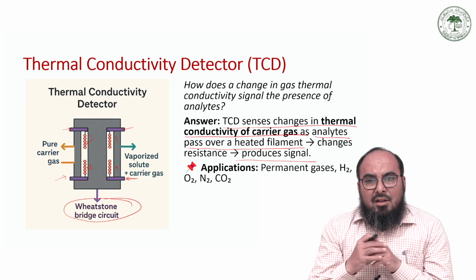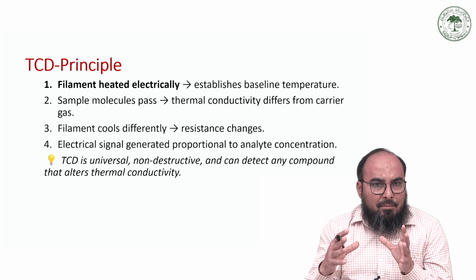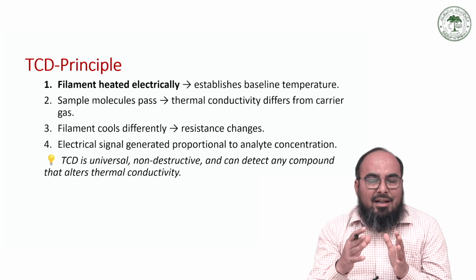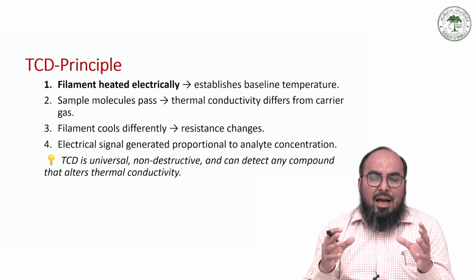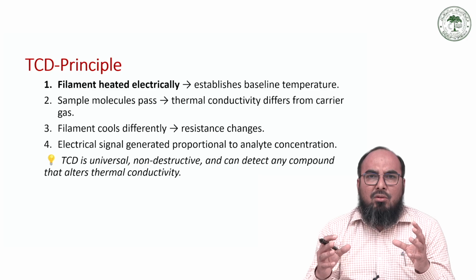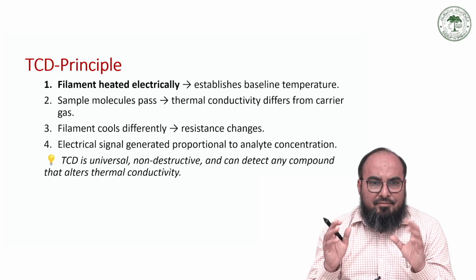So the application is you can sense H2, N2 and CO2 also. The principle is, again, it establishes a baseline temperature. The sample molecule has a certain conductivity which is different from the carrier gas, and the carrier gas conductivity gets cancelled because initially you have run the carrier gas and measured the conductivity of all the four filaments, and when you run it again with your effluent along with the carrier gas, you actually know the conductivity of the analyte alone.